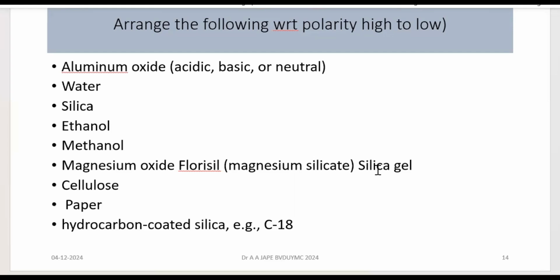So if you know the basic property of these solvents, their polarities, the basics of chemistry we need to revise if we want to go for separation or analysis of biomolecules using TLC or any chromatography. So please read about polarity, hydrophobicity, hydrophilicity, the functional groups of different solvents and substances, so that it will be easier for you to work in the laboratory and to choose the right chemicals for the selected process.